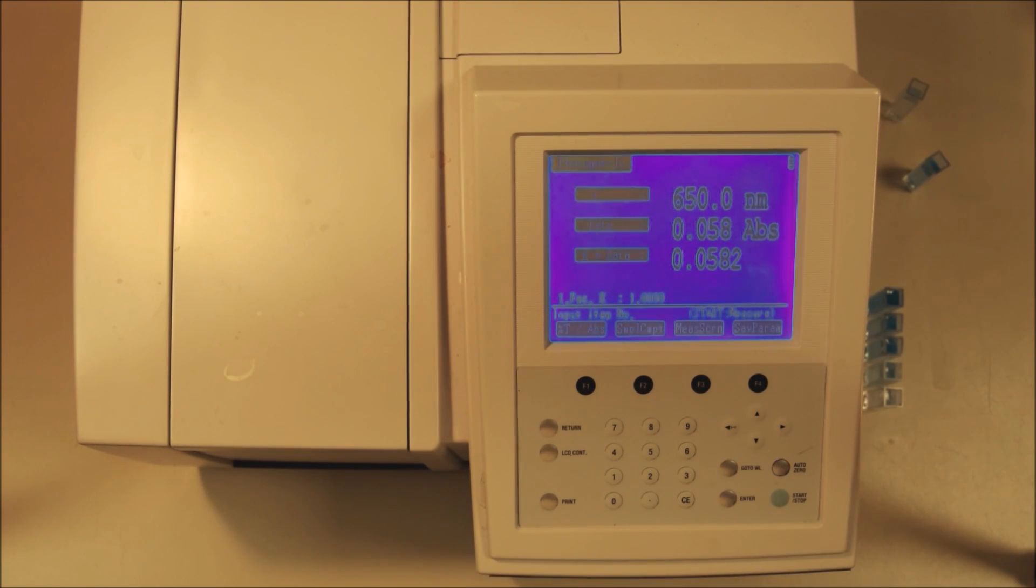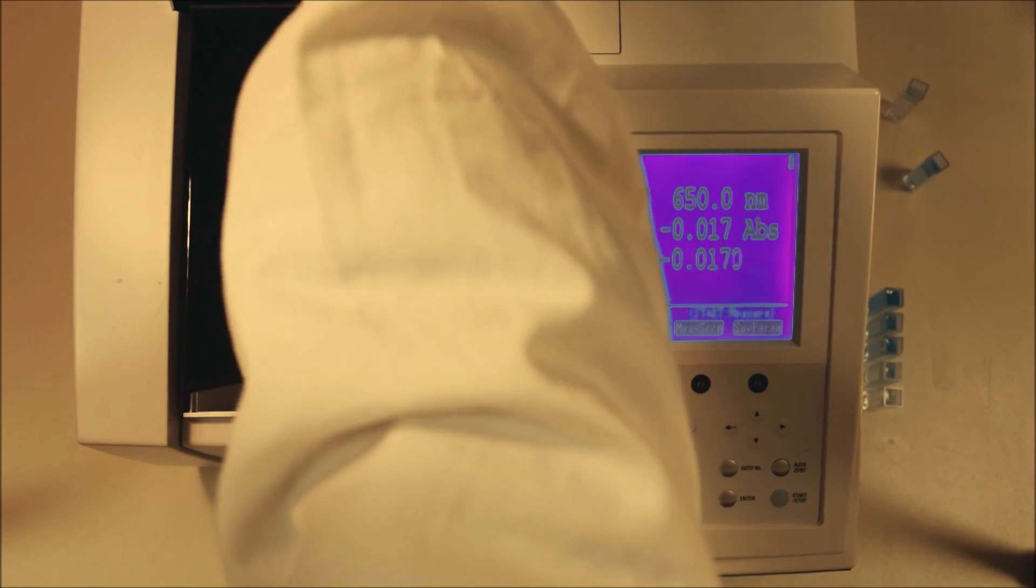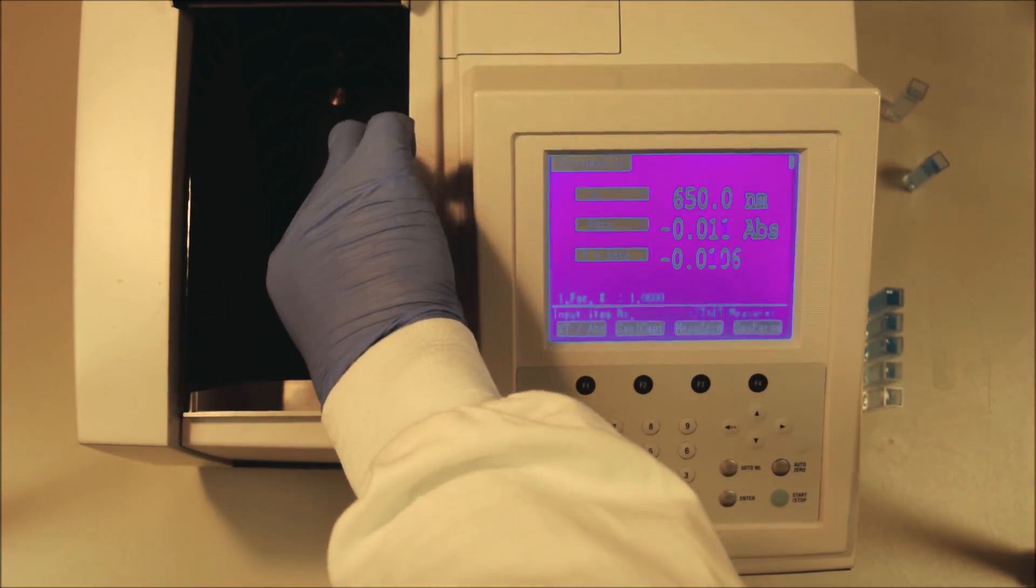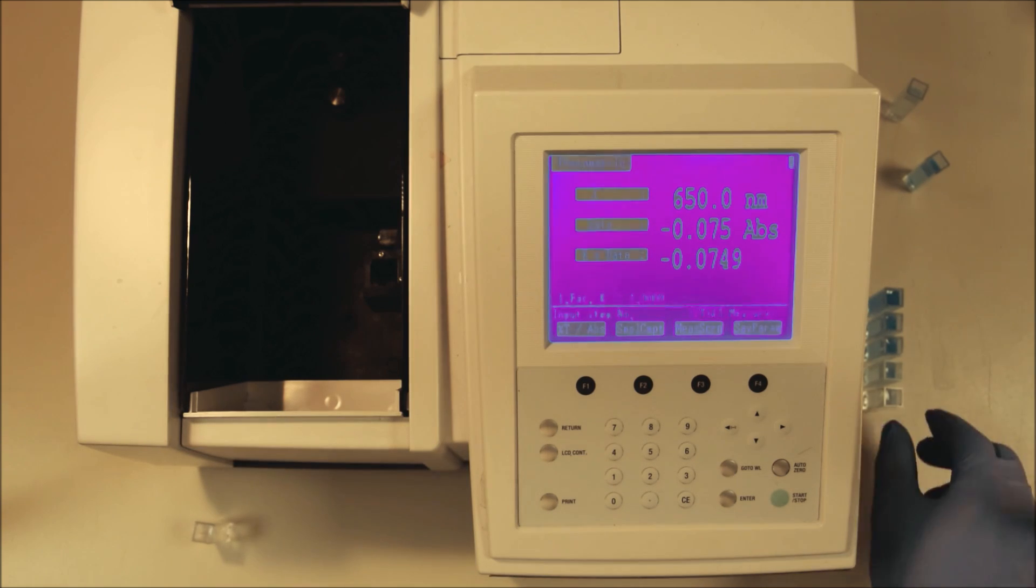So we push auto zero and we wait a few seconds for the machine to zero itself. Once it zeroes itself you'll notice that the absorbance reads at 0.000. Now we're ready to start making measurements. Notice how when we open the machine the absorbance changes. So it's important to have the machine closed so that there's no stray light making it onto the sensor altering our reading.